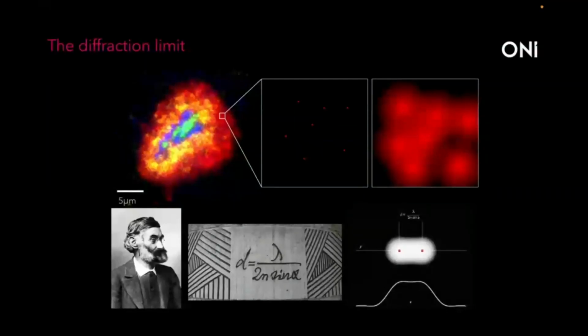You can go right down into very short wavelengths, for example, using electron microscopy. But for light-based fluorescence microscopy, you're typically working in the area of about 300 to 700 nanometers. And generally, the rule is that about half the wavelength is your resolution. So for a typical fluorophore, such as something in the 647 or the 488 channel, your resolution is going to be somewhere between 200 to 300 nanometers. So any two points that are closer than that, you will not be able to distinguish them. And as we pointed out in the last slide, the TCR peptide MHC is only 2 nanometers. So it's 100 times smaller than that resolution limit. So you're missing an awful lot of information.